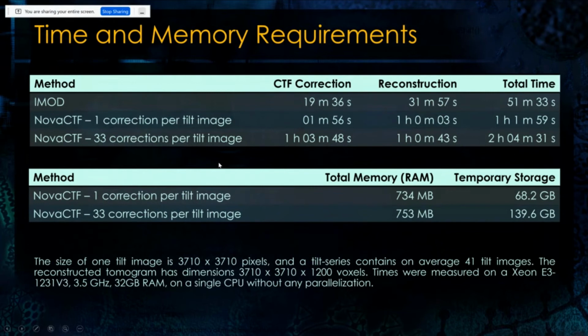What is a bit worse is the temporary storage. So memory-wise, again, because we have it very efficiently implemented, it doesn't matter how many tilt series you have to correct. The RAM memory the program needs is very, very low. It's even lower than IMOD actually.